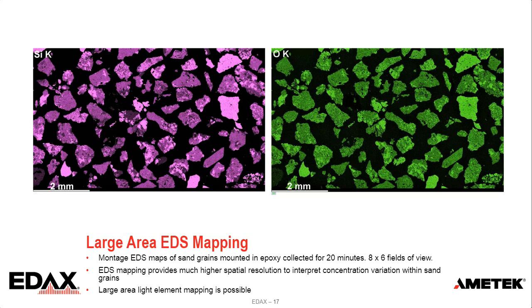Because EDS has much better spatial resolution, those EDS montage maps provide much higher spatial resolution to interpret concentration variation within sand grains. And also, with EDS, large area light element mapping is possible. So here we can show the oxygen map distribution.